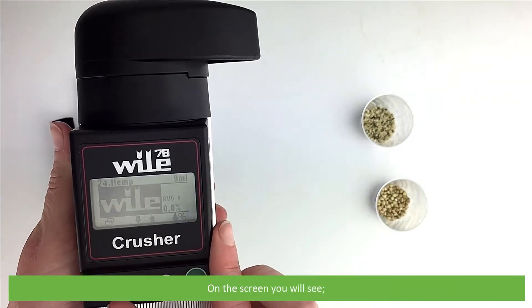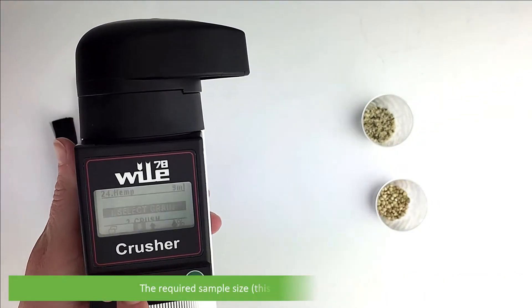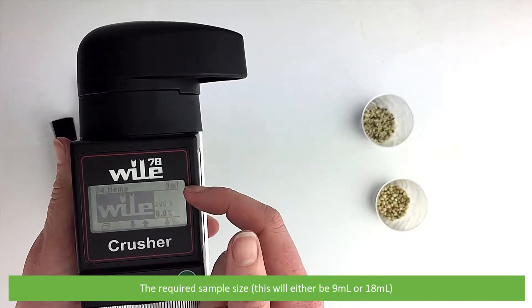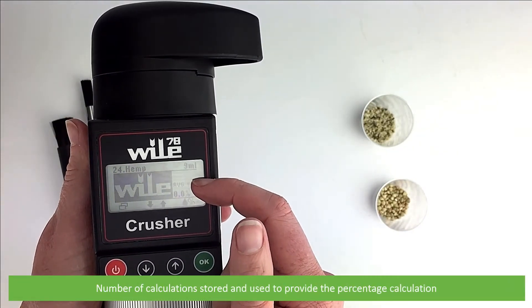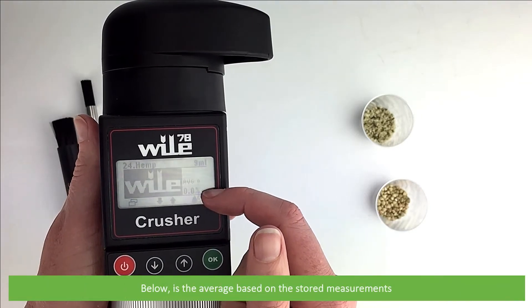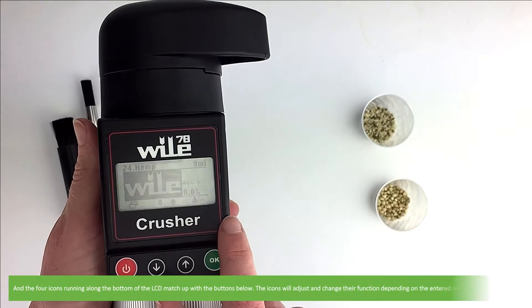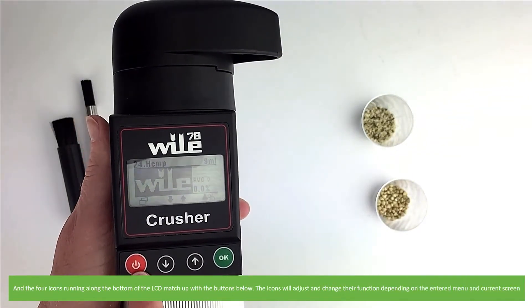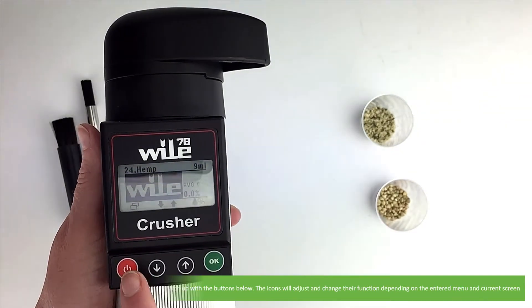On the screen you will see the current grain measurement mode, the required sample size — this will either be 9mL or 18mL — the number of calculations stored and used to provide the percentage calculation, and below this is the average based on the stored measurements. The four icons running along the bottom of the LCD match up with the buttons below, and will adjust and change their function depending on the entered menu and current screen.